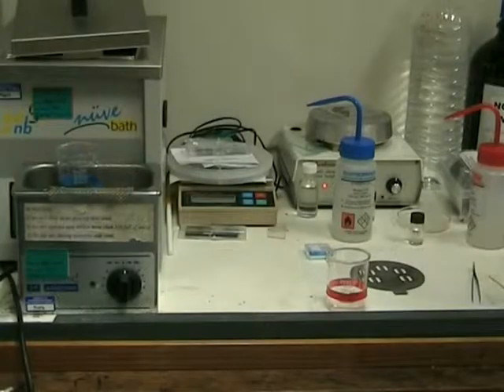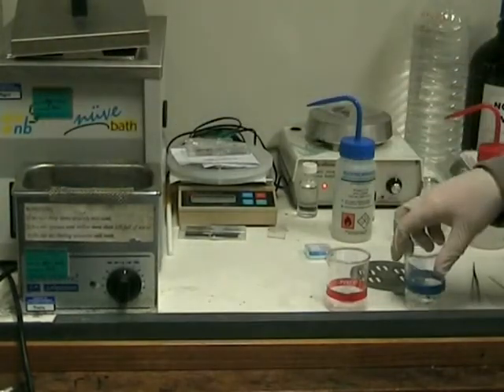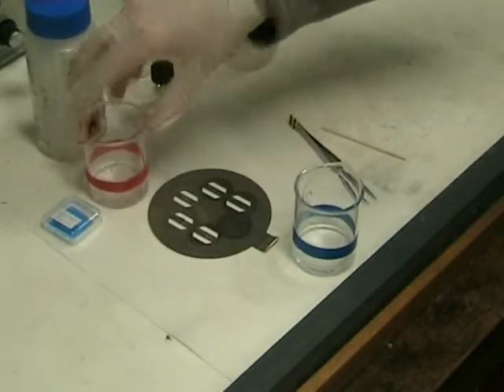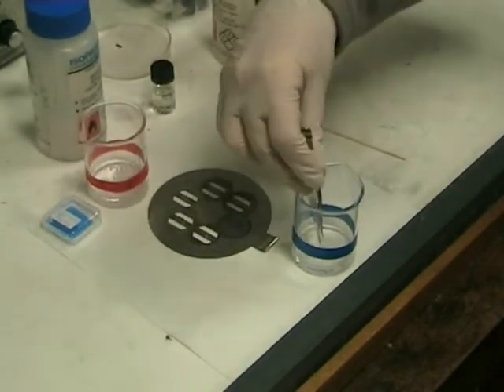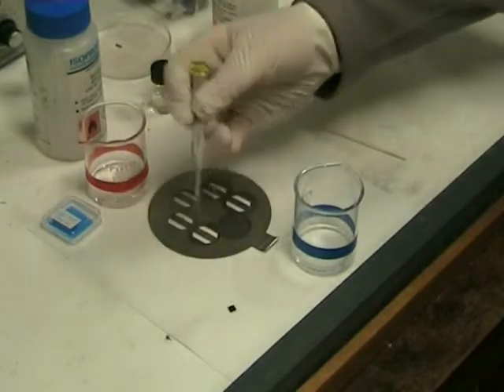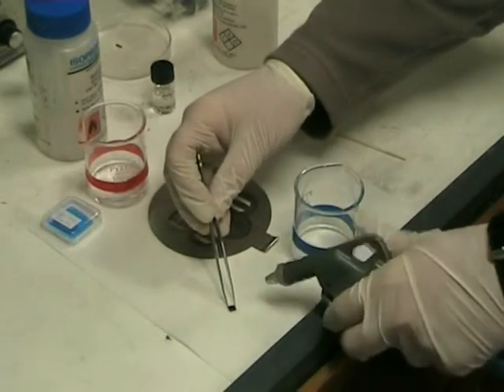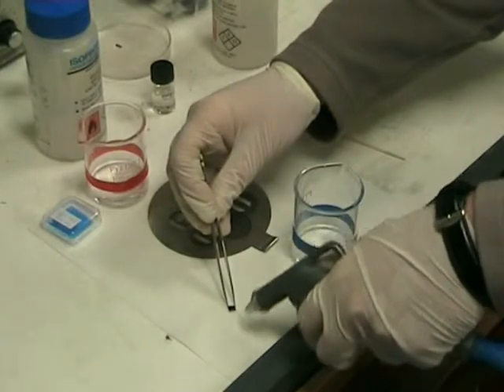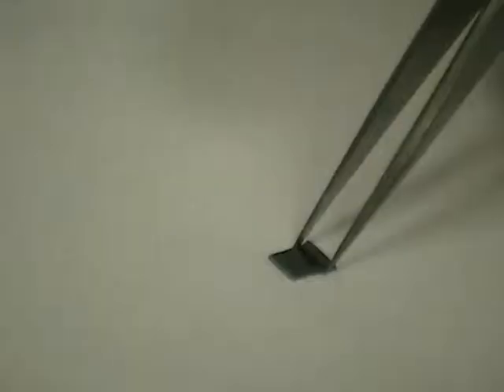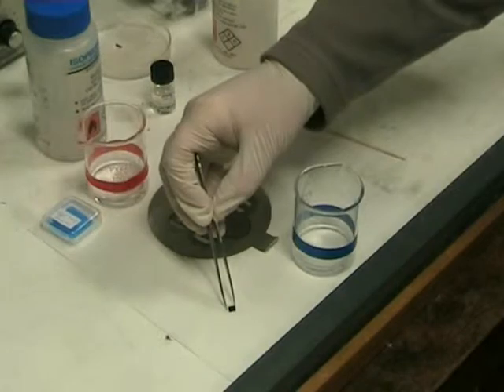When the ultrasonic bath has finished, remove the beaker. Take the sample out and place it on a clean surface or a lint-free cloth. Spray the sample with nitrogen, moving the gun from side to side. Holding the sample onto the surface will prevent it from flying away. This will dry the sample without leaving a residue.